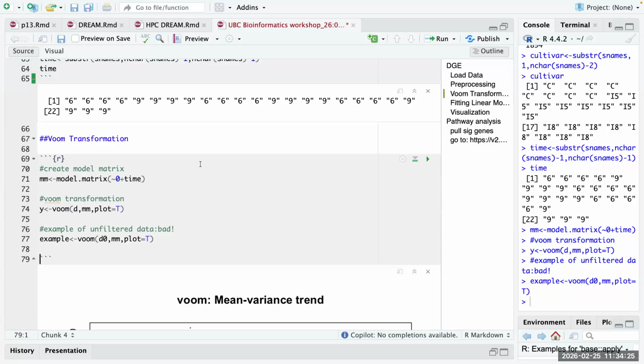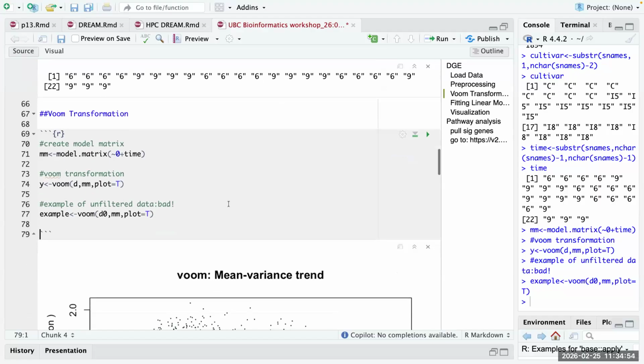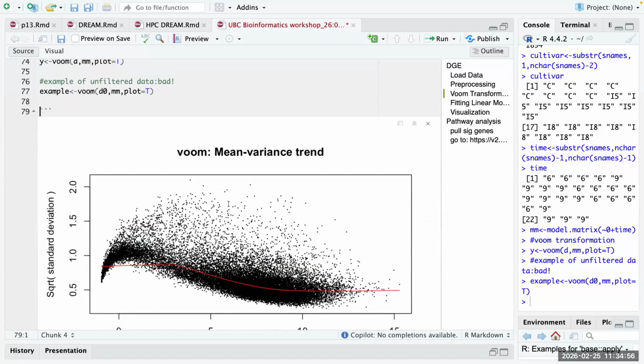Flower A is sampled at time 6 and at time 9, and so are flower B and C. Replicate is how many times they're sampled. Each flower is sampled at 2 time points, and for each time point, it's sampled across 4 replicates. Thanks for the question. Do we have more questions online?